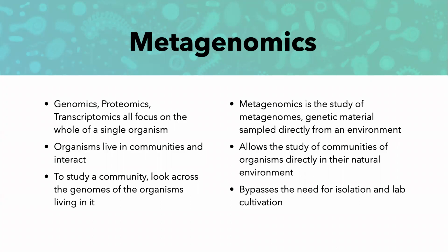When we talk about metagenomics, we're talking about a whole community and the diversity of that community, as well as how the community interacts with itself or with the host. And metagenomics is in a way a real transformational technology. Next generation sequencing has allowed us to study metagenomic and microbiome communities without isolating those specific bacteria in the lab.